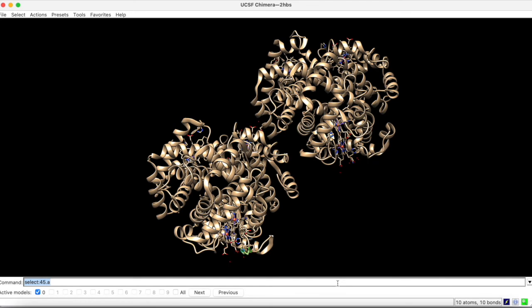To select the same residue position across a number of chains, simply add a chain range as shown.